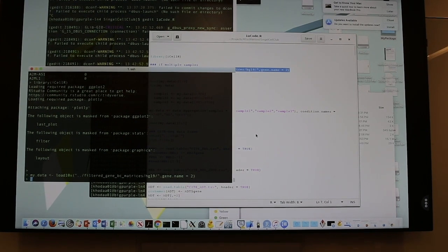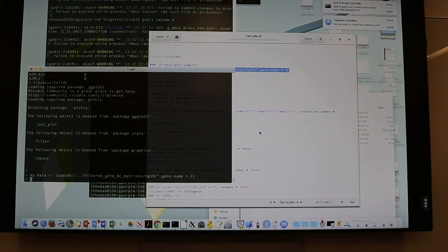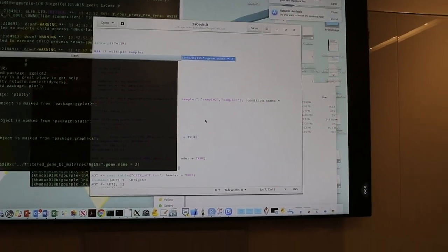So Reza, what's the data you're going to be analyzing today? This is my data set? Whose data set is this? I don't remember whose data set this is. I mean, what are the cells? So these are blood samples. But this is just a small proportion of someone's data that is already published.